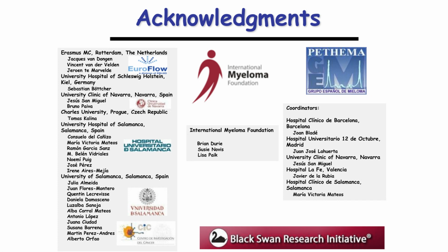So the only thing that we can do is to compare with other available techniques, and most of the time, as I showed in the presentation, the concordant results rate is pretty high. And also we can wait a little bit longer and look at the survival impact of the result. In those two aspects, I would say that we are pretty sure that samples coming from patients that are concluded as MRD negative are indeed negative at the highest sensitivity level.